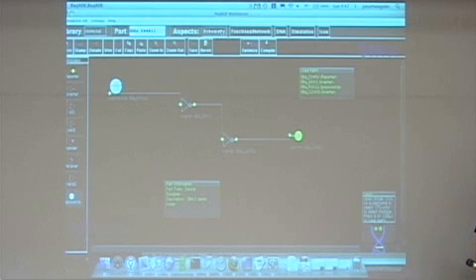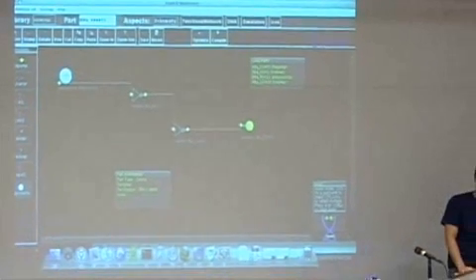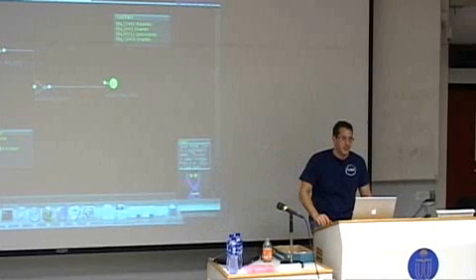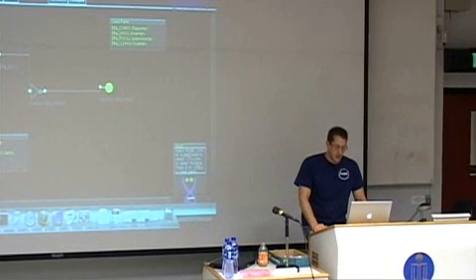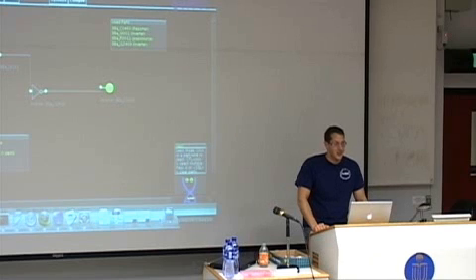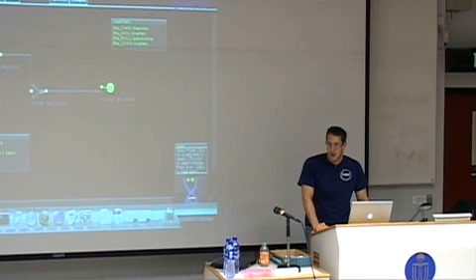But I think the ideas are still powerful because it shows you that you can take DNA and put it together from a high-level representation, which is something that biologists really don't like to even think about or consider. Can you save this as an uncompiled design and then use that in something else and then compile that?